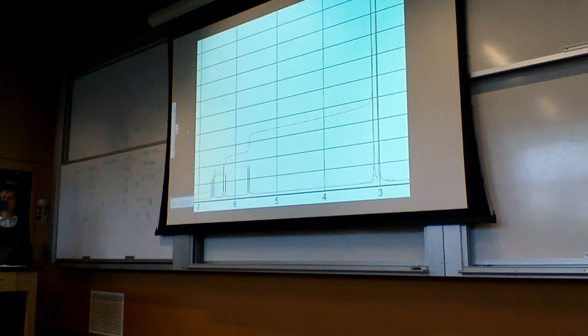With the methyl groups on the nitrogen, do you have to assign which one is which peak? Does anybody know which one's up or down? No, you don't need to assign which one is which.